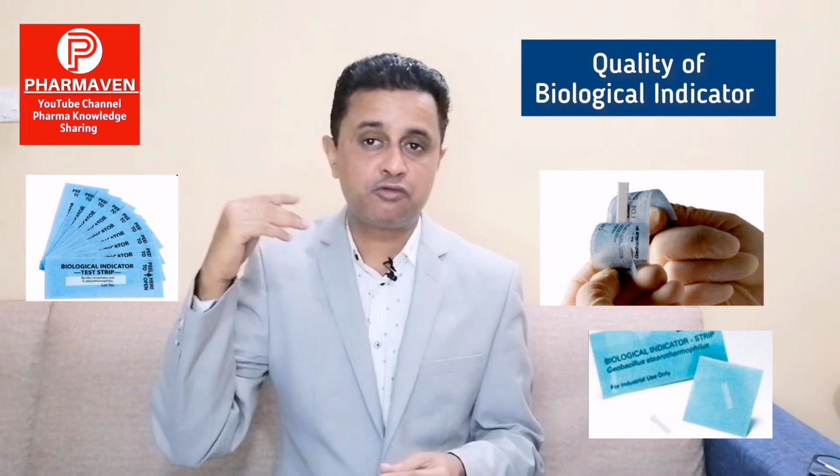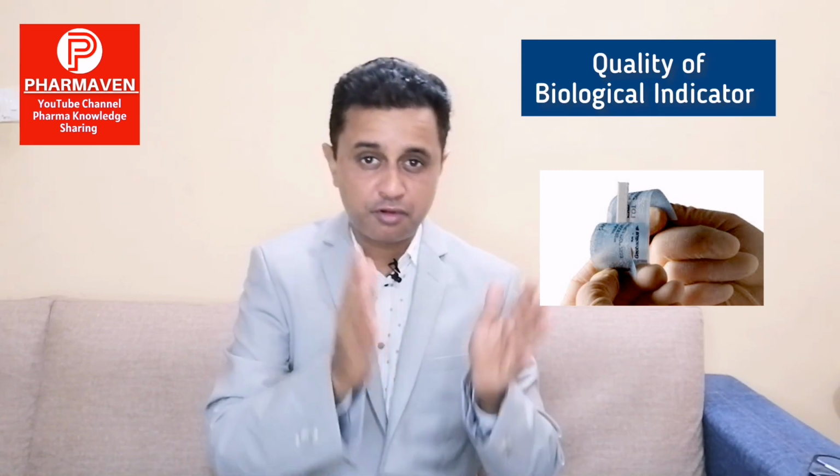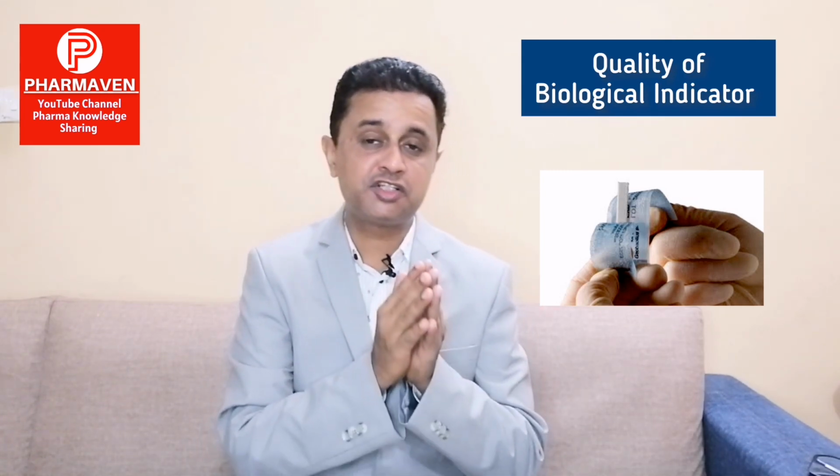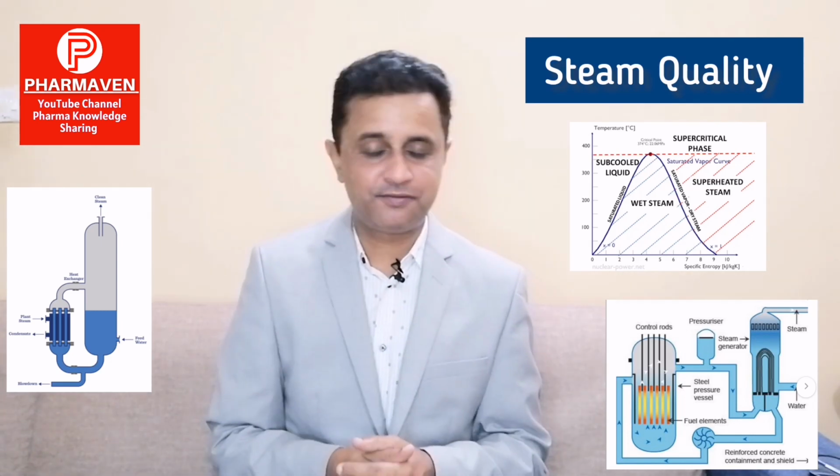So we also have to look at the BI quality, whether it is appropriate quality, an approved vendor, what the spore count claimed by the vendor is, what the D value is. All this we have to factor out to rule out the BI quality. Fifth one is steam quality itself.